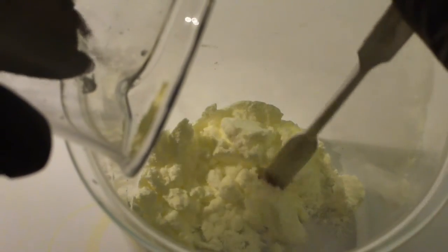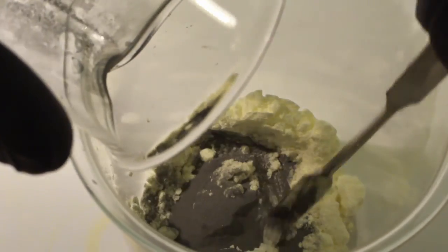Now add the iron powder to the sulfur and blend thoroughly until the mixture obtains a great and uniform color. This may take a few minutes.